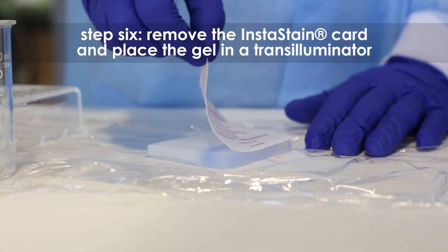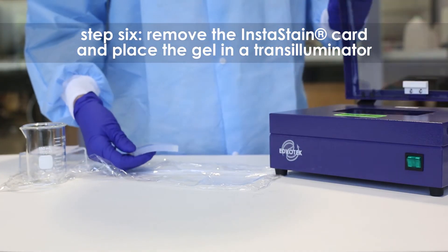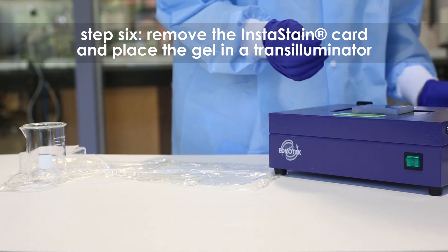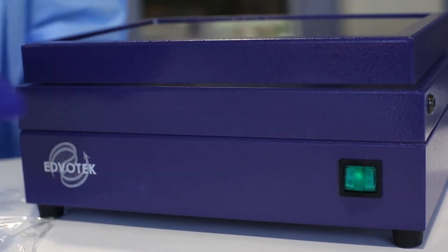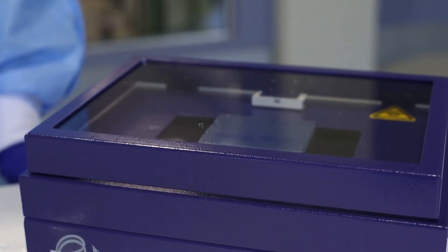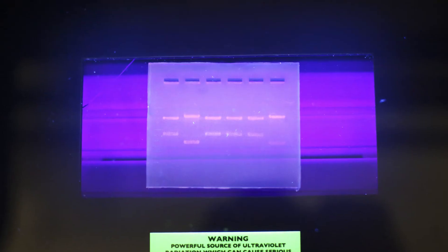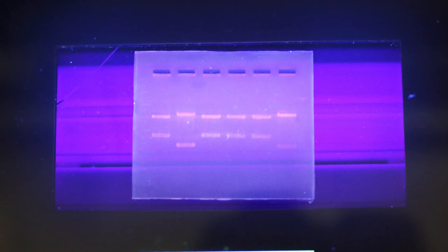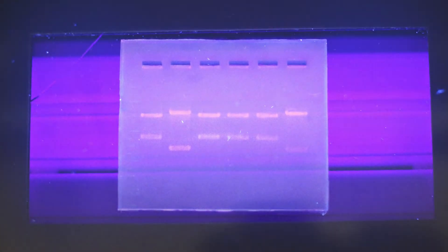Step 6: Remove the instastain ethidium bromide card. Visualize the gel using an ultraviolet transilluminator. The DNA should appear as bright orange bands on a dark background. If the bands appear faint, repeat staining with a fresh instastain card for an additional 3 to 5 minutes. The instastain ethidium bromide cards and stained gels should be discarded using institutional guidelines for solid chemical waste.